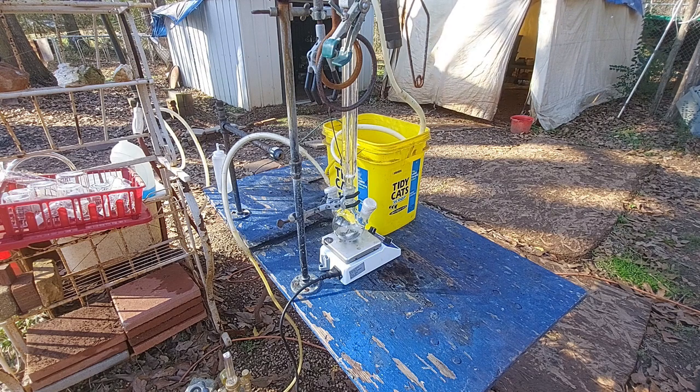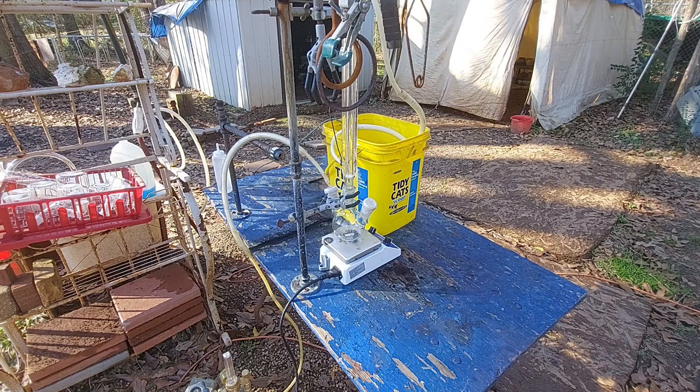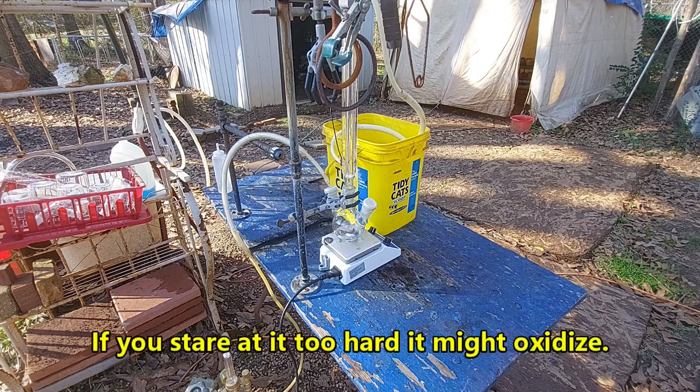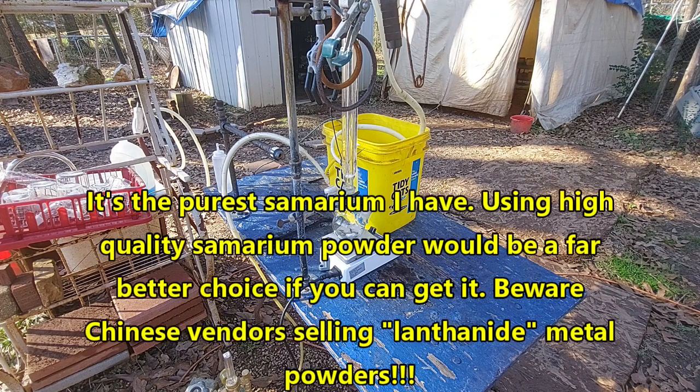At this point I will absolutely take either one because I'm really tired of dealing with this experiment. I have put so much work into this it is ridiculous. Samarium diiodide is a tricky compound to make — it is very sensitive to the influence of air, water, and evil spirits. I have only been able to produce this compound transiently by thermal decomposition and it almost instantly broke down. We are going to try to make it from dendritic samarium in THF.